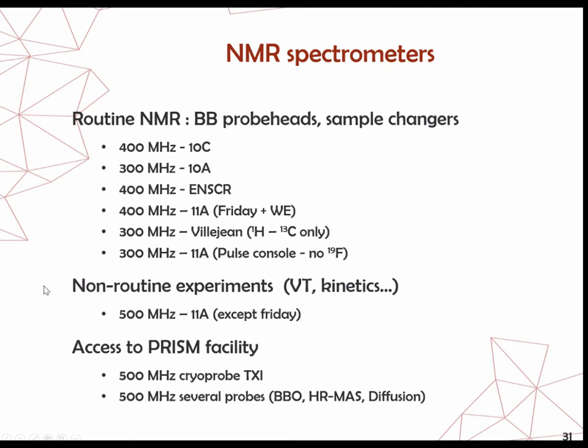Okay, don't hesitate to ask for a level 2 training if you need to use the 500 megahertz for non-routine experiments, such as variable temperature or kinetics or other things.